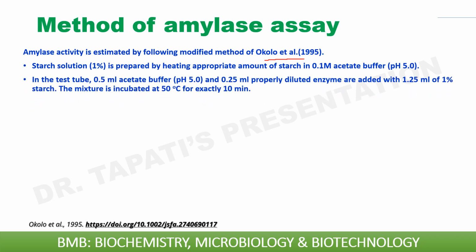In the test sample, 0.5 ml acetate buffer and 0.25 ml properly diluted enzyme were added with 1.25 ml of 1% starch.